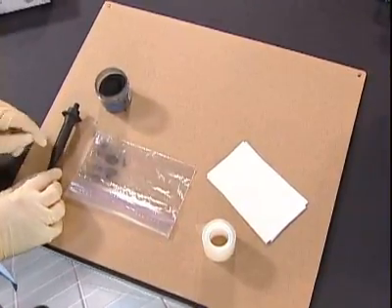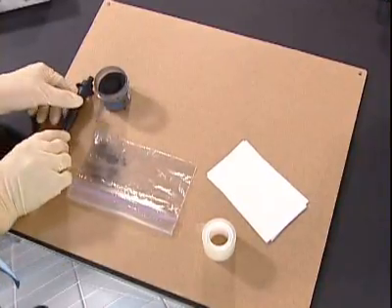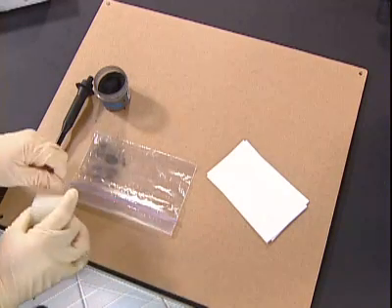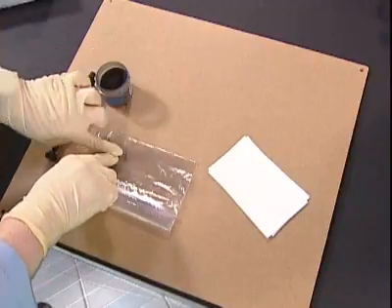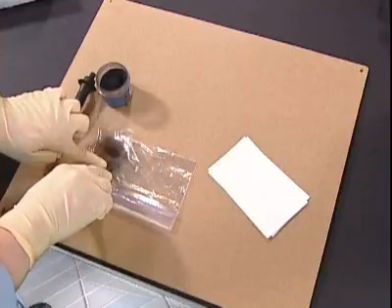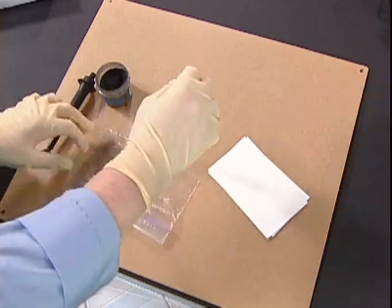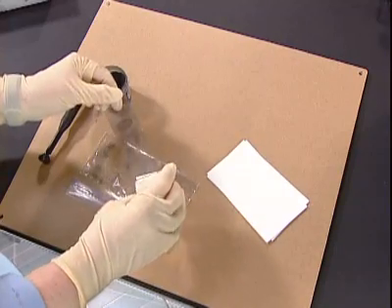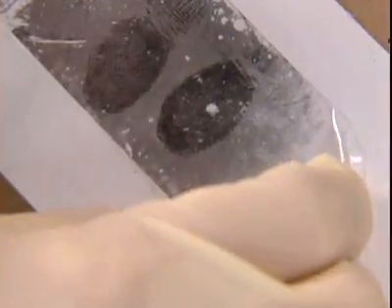Once they've become visualized, get the last little bit of powder off here, then it's a matter of using the lifting tape to lift those latents off the bag and put them on a backing card. Now the latent has been lifted onto the tape and it can be placed on the white backing so that it is now preserved and can be used later for the comparison.